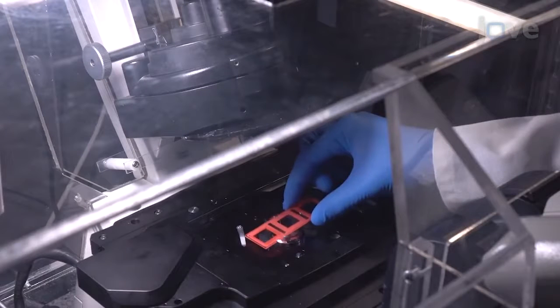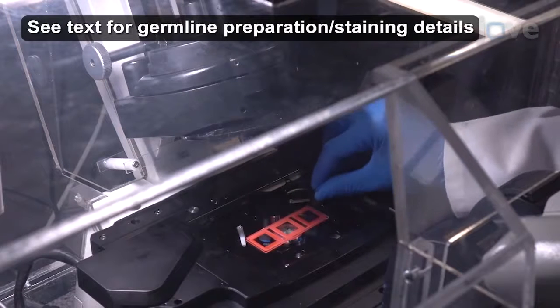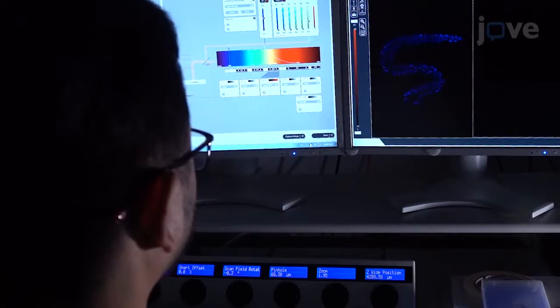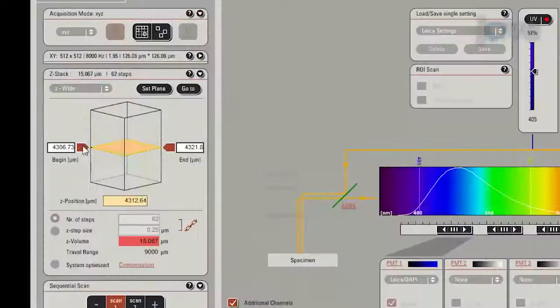To image the samples, place slides with stained germlines into the slide holder above the 63x objective of a confocal microscope, and locate a germline. Focus on the top of the germline and mark it with the confocal microscope software.